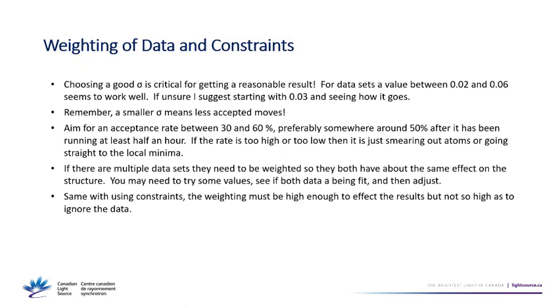And when you first start it, it's going to accept almost every move, right? Because you have all your atoms stacked on top of each other. You basically have a delta function. You need to broaden it out. So it'll select almost everything at first just to broaden out the really sharp peaks. And then it'll kind of fall into something around here. And if it doesn't, then you would need to adjust it.